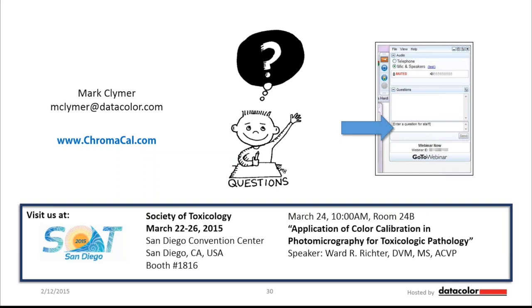I have another question for Dr. Hammond here. Now that you've tested and established your linear states for your imaging systems, are you seeing any drift over time? Well, we started taking that regularly in December, so we haven't really seen a drift over time.